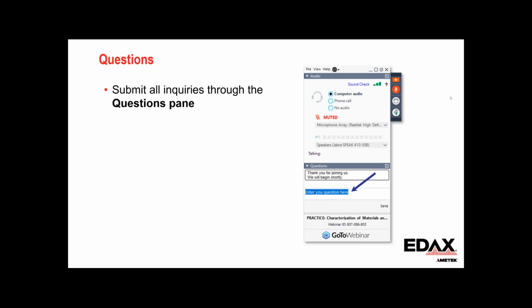And part of that, we can use the EDS to still parse down the phases. Of course, yeah. Or if you could create a partition in analysis, then you could index one partition only against 2 phases and another partition against a different set of phases. So the answer is yes in the worst case scenario.